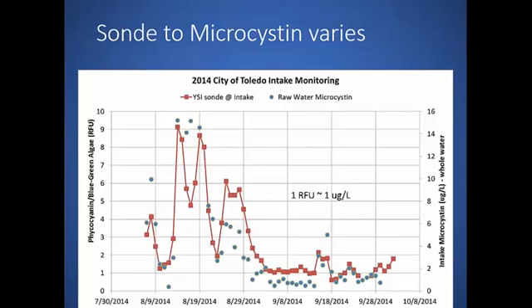Lake Erie is very dynamic. Wind is changing. The bloom is being pushed around. We're having mixing happening. If I were to show the chlorophyll this period, the chlorophyll did stay elevated, but the phycocyanin dropped. So it's not a perfect solution, with one jump this way, one jump that way. But again, it's another tool and it's continuous.